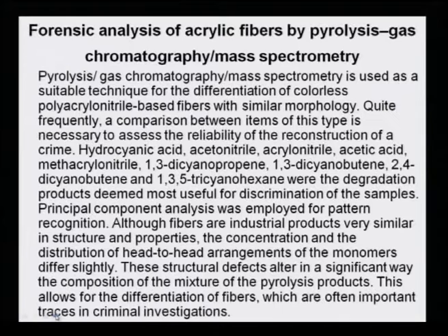Now, when we have samples of acrylic fibers and pyrolytic gas chromatographic analysis is carried out, these are the compounds like hydrogen cyanide HCN, CH3CN, acrylonitrile, acetic acid.